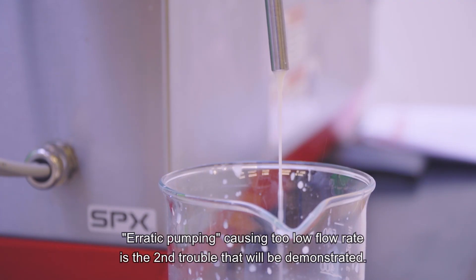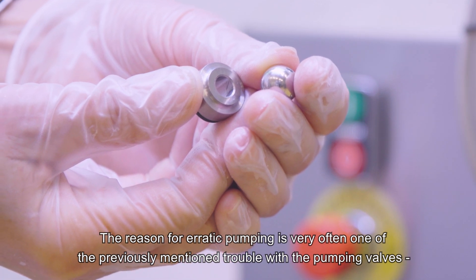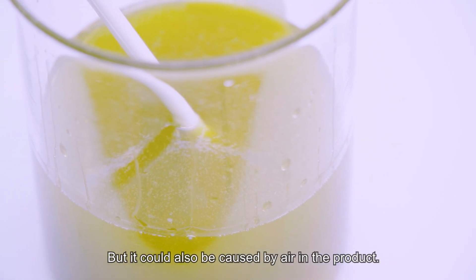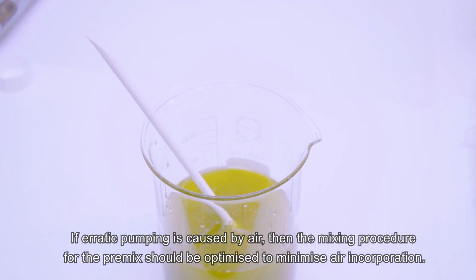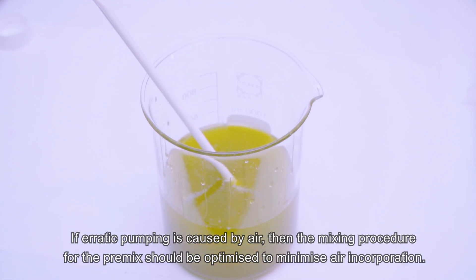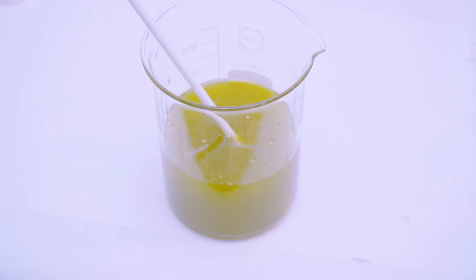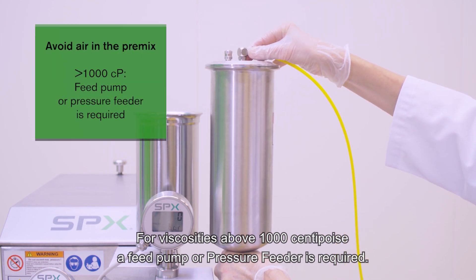Erratic pumping causing too low flow rate is the second trouble that will be demonstrated. The reason for erratic pumping is very often one of the previously mentioned troubles with the pumping valves, and the possible solutions are already described. But it could also be caused by air in the product, or if it's a highly viscous product, by insufficient feeding conditions with too low feed pressure. If erratic pumping is caused by air, then the mixing procedure for the premix should be optimised to minimise air incorporation. De-gassing might be required. For viscosities above 1000 centipoise, a feed pump or pressure feeder is required.